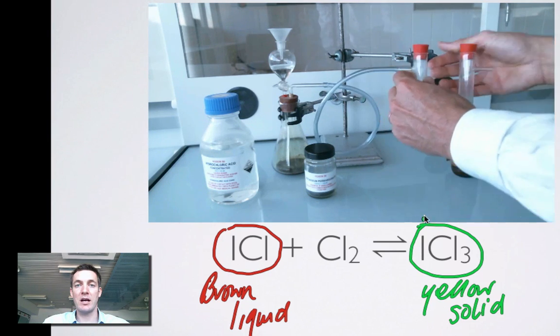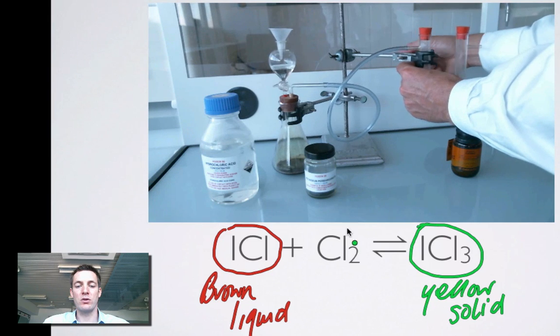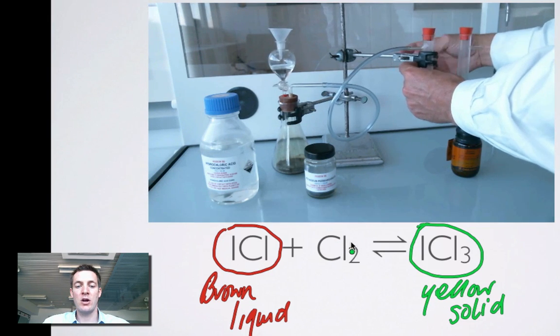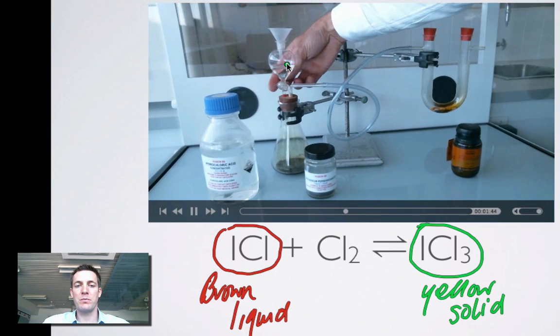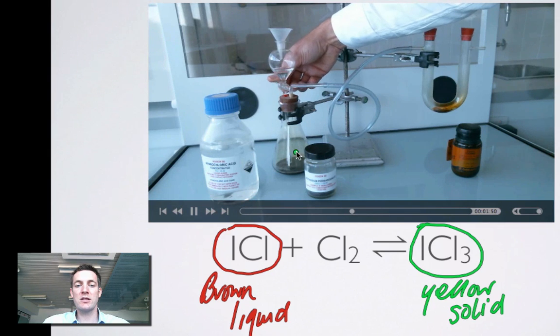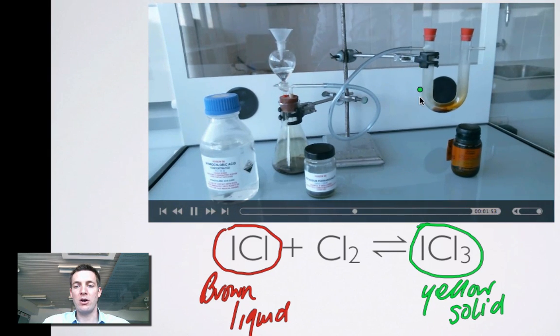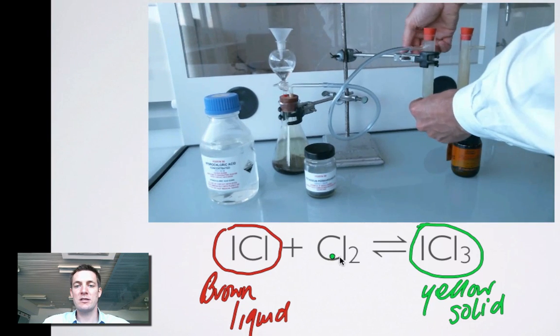Just going to connect the thing back up again now so that we can actually see what happens when we add more chlorine to the system. So we've just seen us removing it. We're now going to add chlorine to the system. So I'm going to pour some more hydrochloric acid down onto the potassium manganate. Chlorine will start to form in this flask here. And it will pass through this tube and over the brown liquid which is our iodine monochloride.